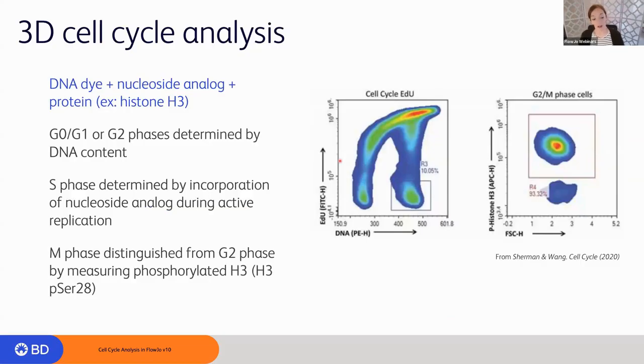Okay. Now we can get more complex, right? So my complexity will stop here at 3D cell cycle analysis, but of course there can be multivariate analysis that goes up to 4D or even has a temporal component. But one of the more commonly used approaches is this 3D model here, where we're starting to build on the univariate and the 2D.